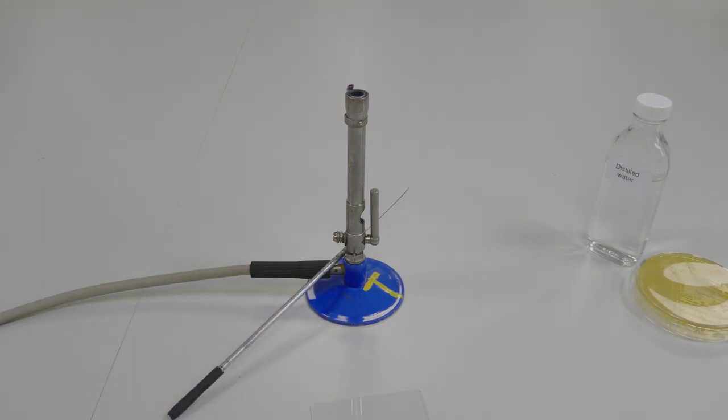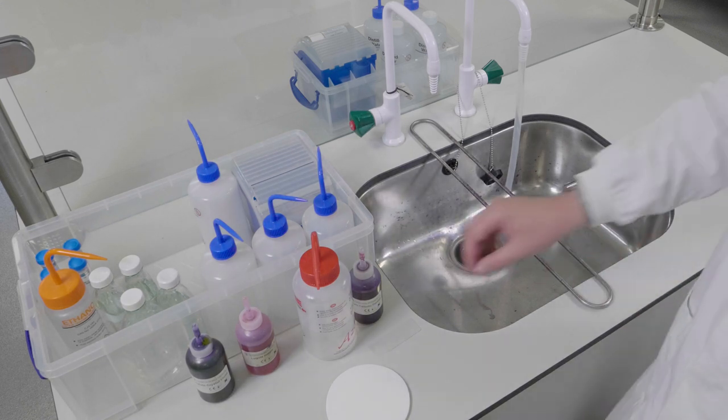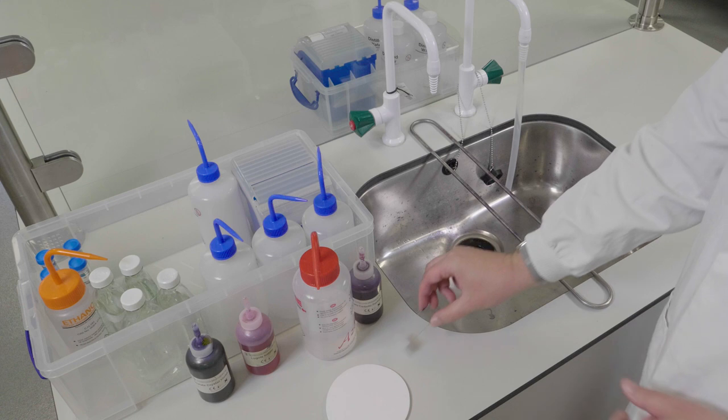As you've just seen on the video, you take your slide and run it through the Bunsen flame three to four times. You're now ready to start gram staining.